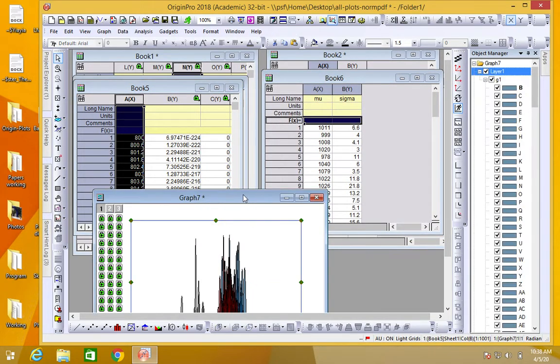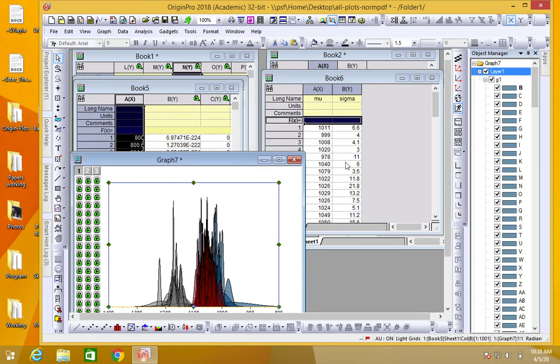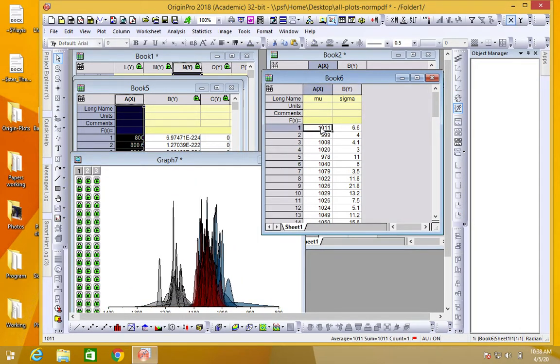Very simply, to give a demonstration, if I change the date here for 1, let's just say something obvious, to 1400, all of the calculations for every single column in this book will start to recalculate, and you can see it doing it here. If I had changed more than 1 point, all of these would recalculate as well.